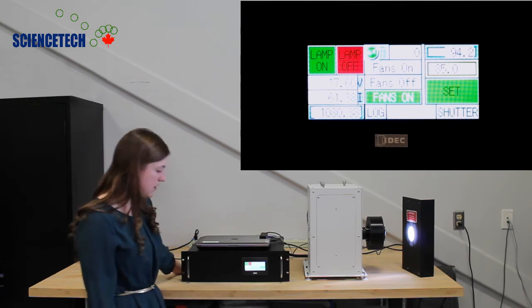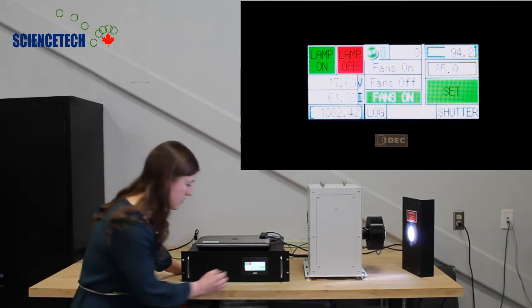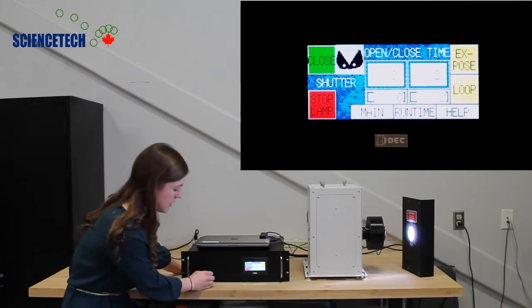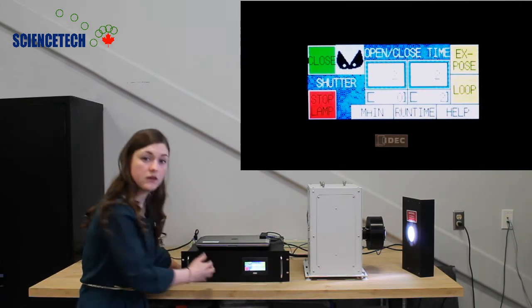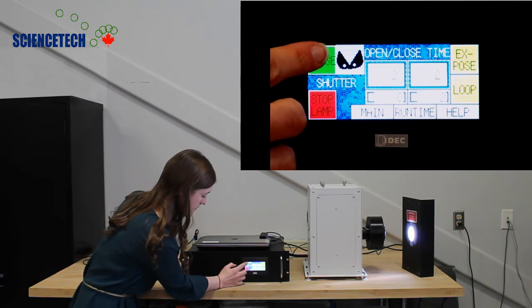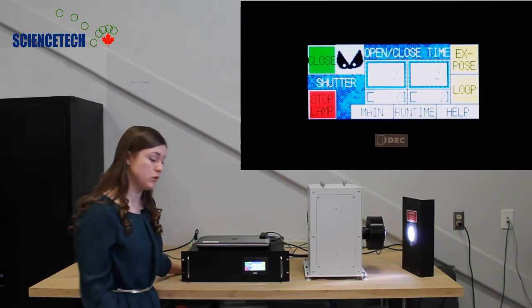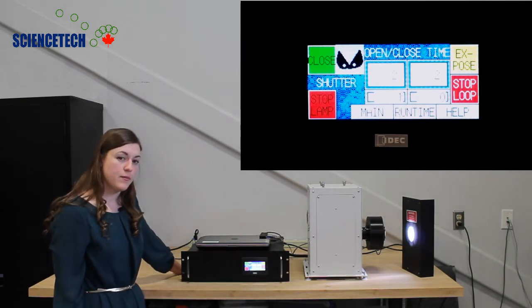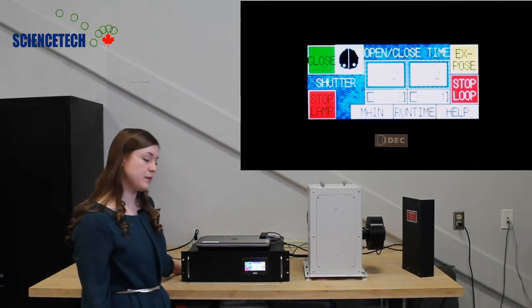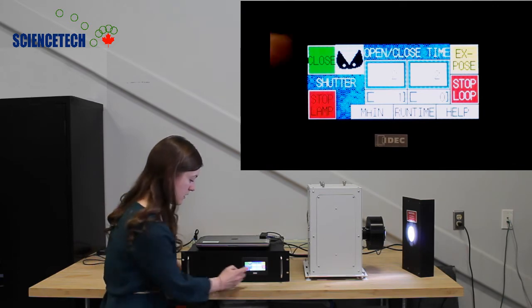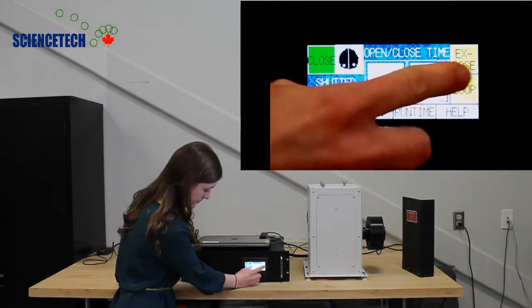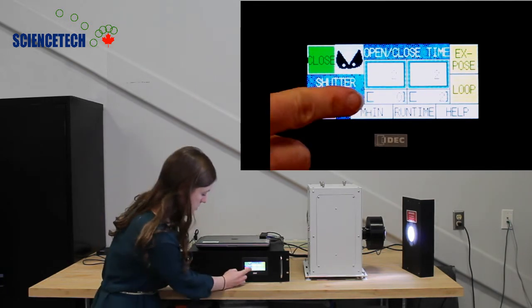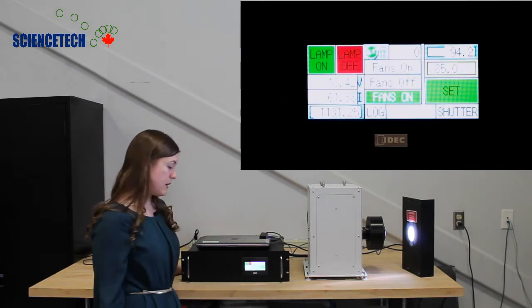When the lamp is on you can operate the shutter by hitting the shutter menu. Now you can manually close or open the shutter. Or you can set it to a loop. The timing between opening and closing for the loop is programmable. And at any time you can just stop it. You can return to the main menu.